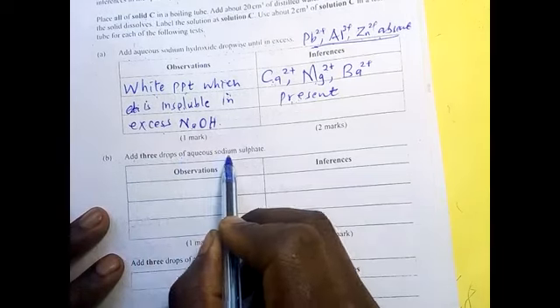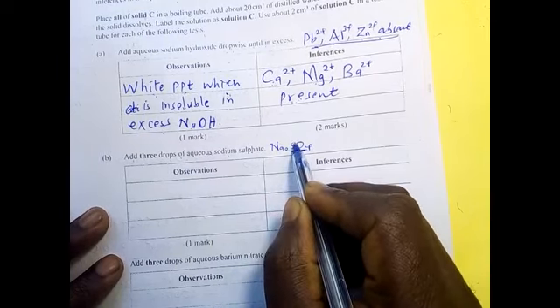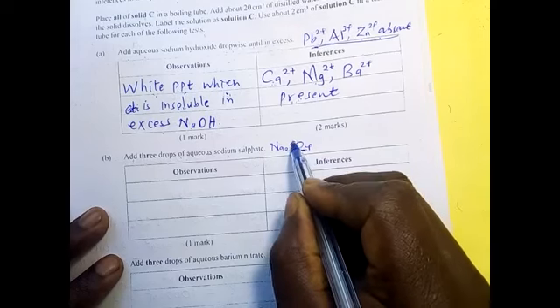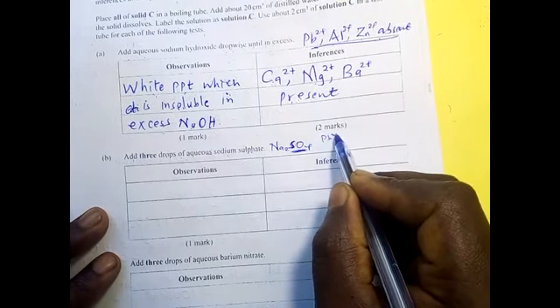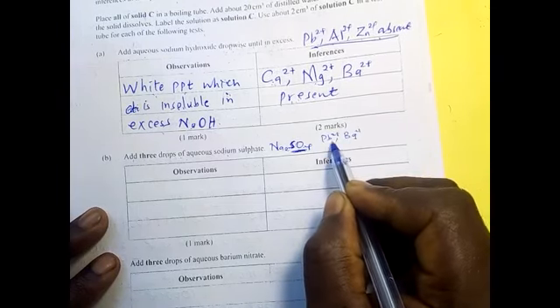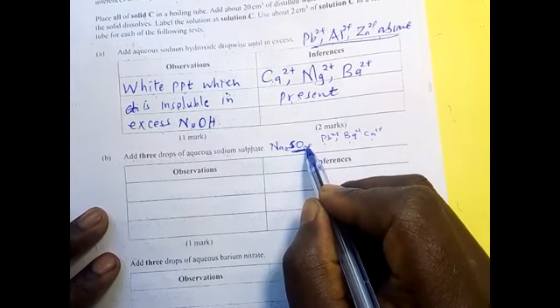Add 3 drops of aqueous sodium sulfate. We are adding sodium sulfate, so you are seeing the sulfate. Remember, all salts of sodium are soluble. So we expect that if it gets into that solution in our test tube and finds lead 2+ ions, it will form a white precipitate. If it finds barium, it will form a white precipitate. If it finds calcium, it will form a white precipitate. We know the sulfates which are insoluble form white precipitates.